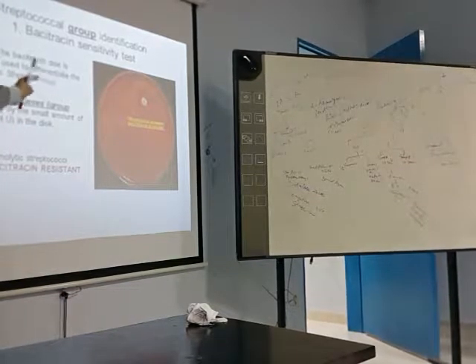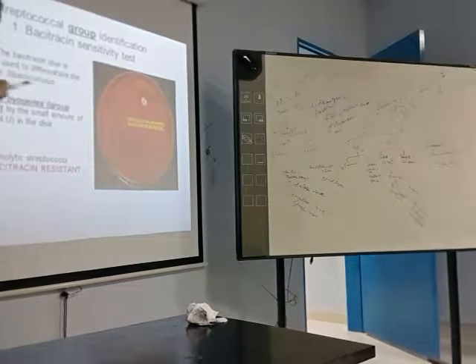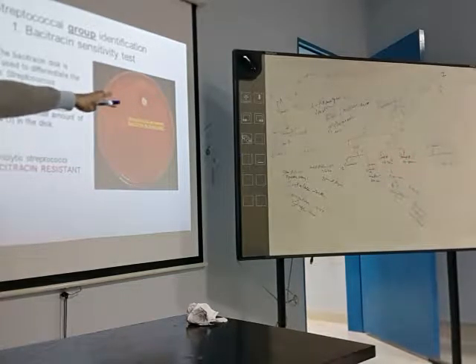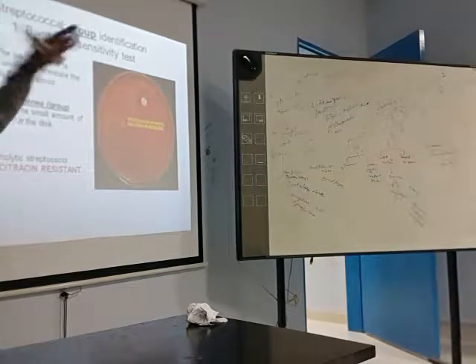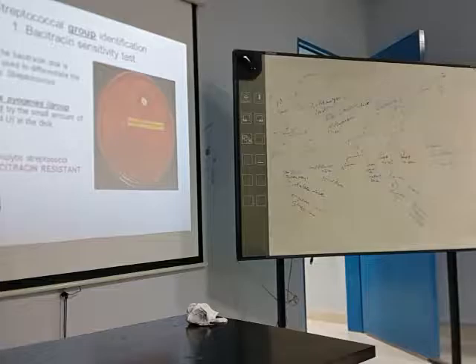And why is this test done? To differentiate between the beta hemolytic Streptococcus. Group A Streptococcus is sensitive, and other beta hemolytic Streptococcus are resistant. The white point in the culture is the sensitive one.